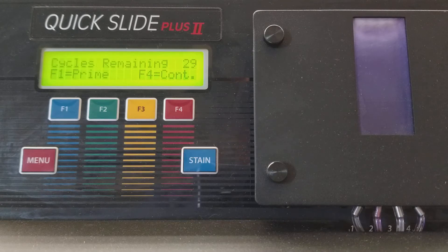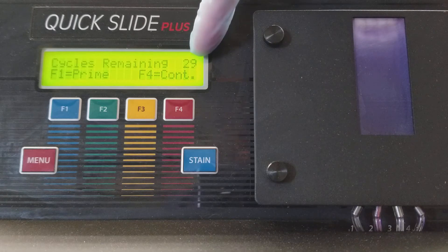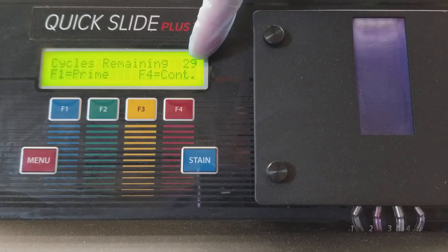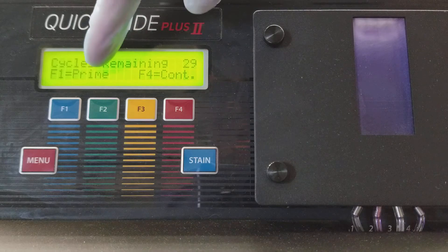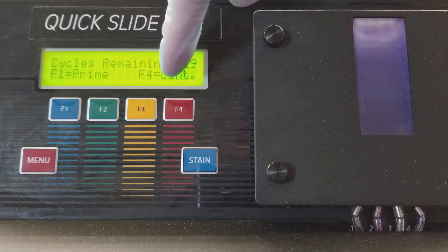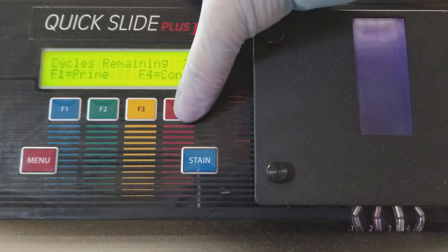So now it's telling me how many cycles I have remaining. I have 29 left and I can either prime again or I can continue on and I'm going to continue on.